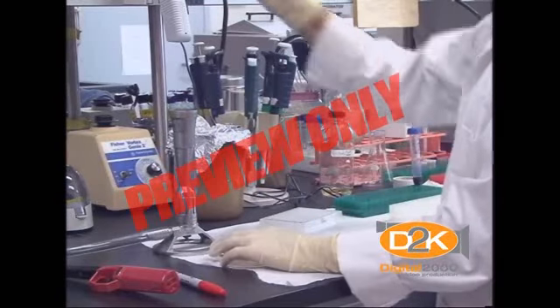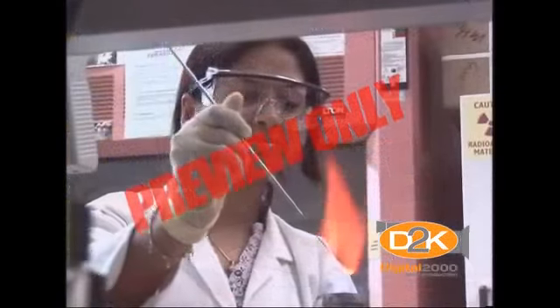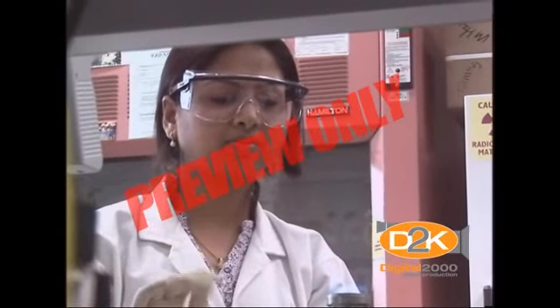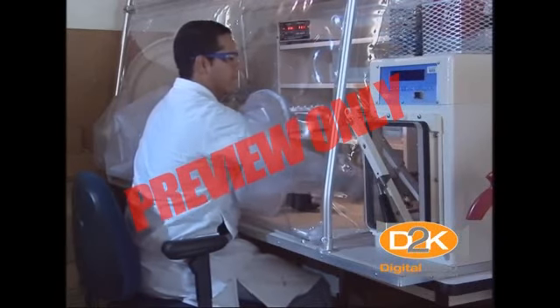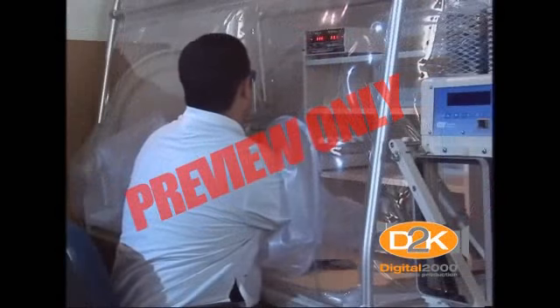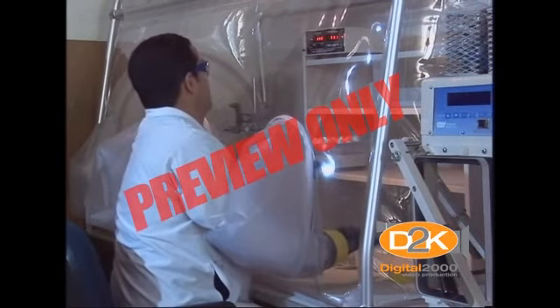Ventilation controls are designed to prevent employee exposure to airborne contaminants. The use of exhaust air treatments from isolation rooms is an example of a ventilation control. Isolation controls are used when ventilation systems cannot keep hazardous chemicals from the general atmosphere. Fume hoods, glove boxes, and ventilation storage cabinets are all examples of isolation controls.